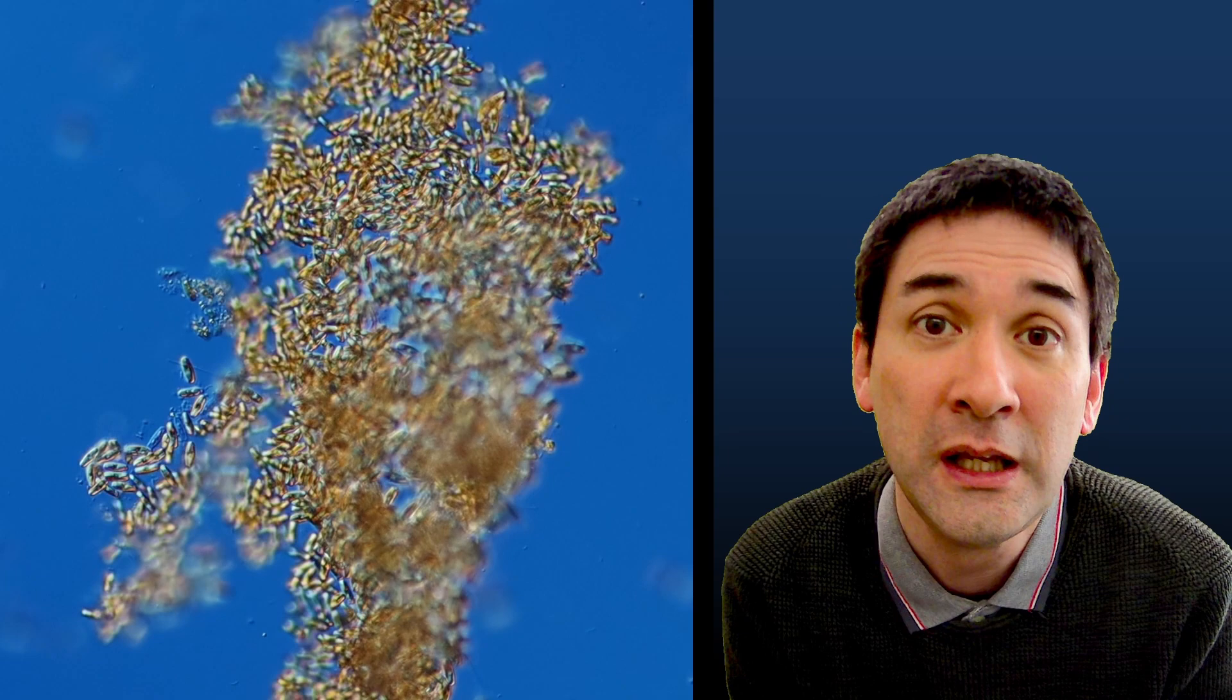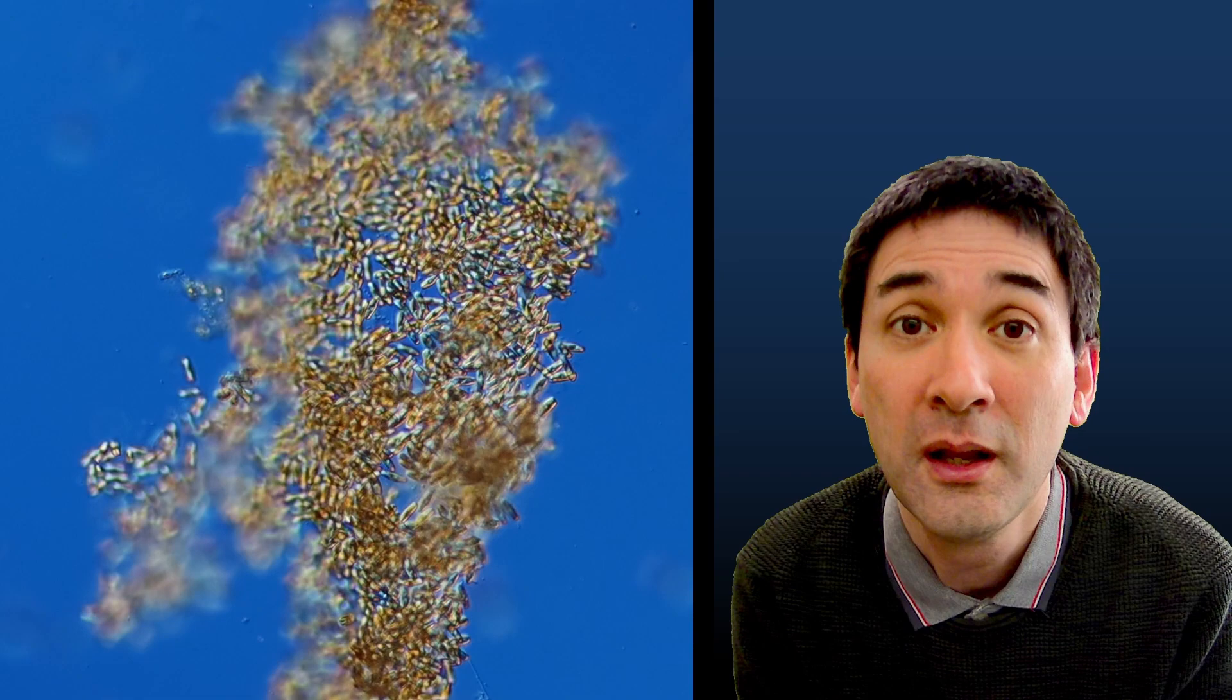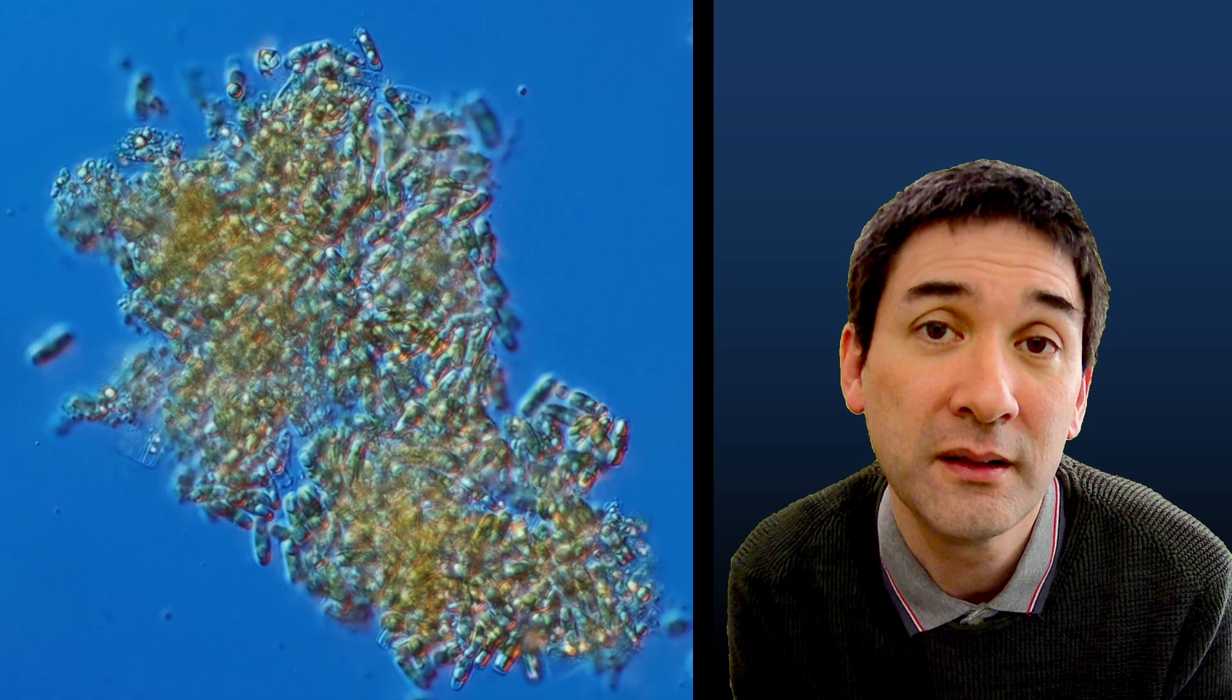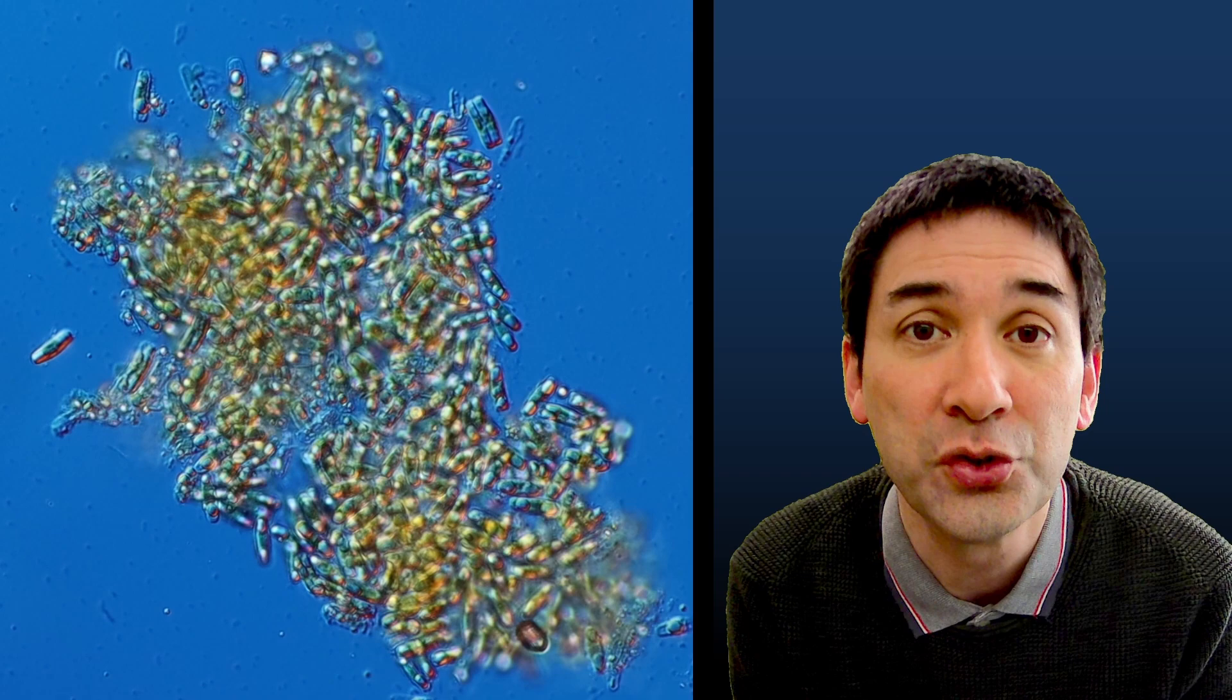And when I zoomed in a little bit more, I could see the individual cells. And these are most likely diatoms. Diatoms are single-celled algae. And they are quite unique because they have a shell made of silica. And at a higher magnification, we can even see the regular structure of those diatoms and also the chloroplasts, the green structures inside the individual cells.